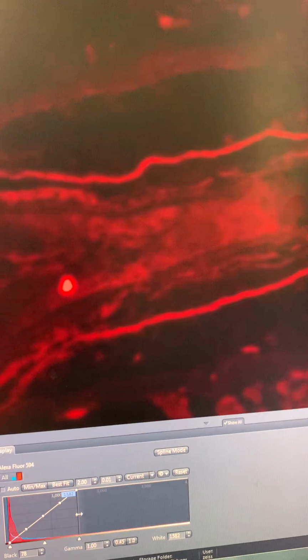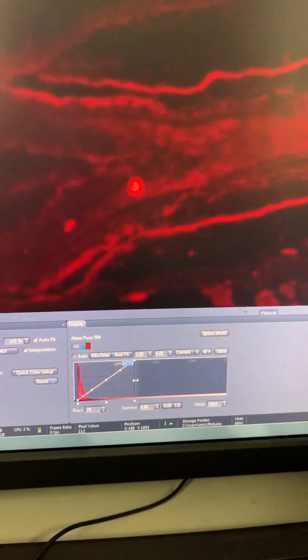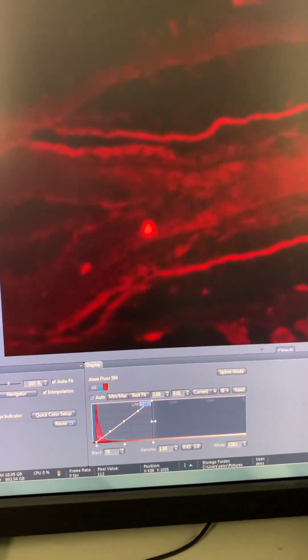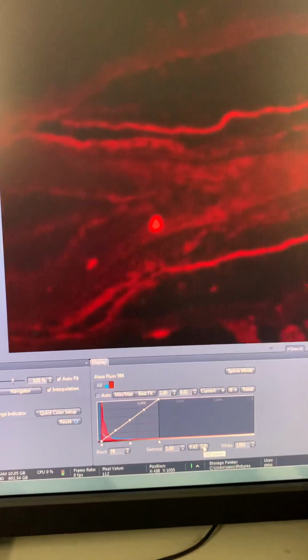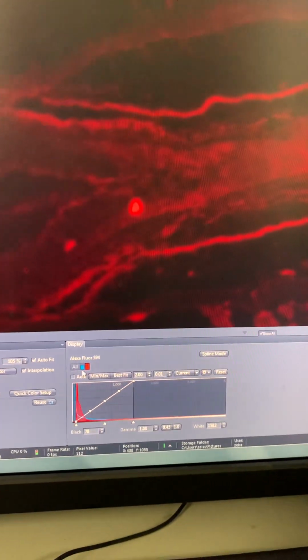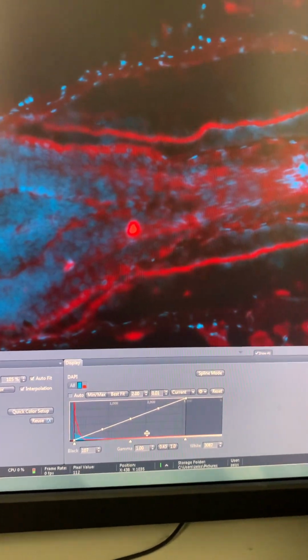This is a non-linear adjustment. And if you do that, you really have to tell your readers in your journal or in your thesis that that's what you've done. So normally, my suggestion is you don't do it unless you very specifically need to do it for a reason. Okay, so adjust each channel, decide where it's going to be, and then keep that constant from image to image.